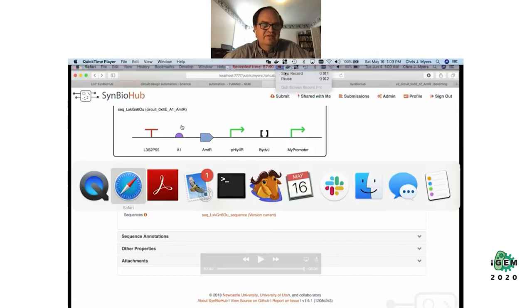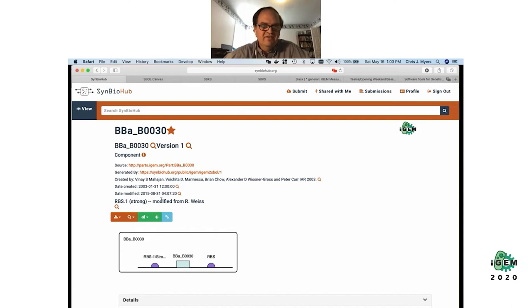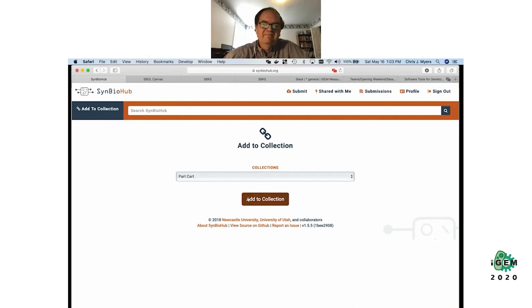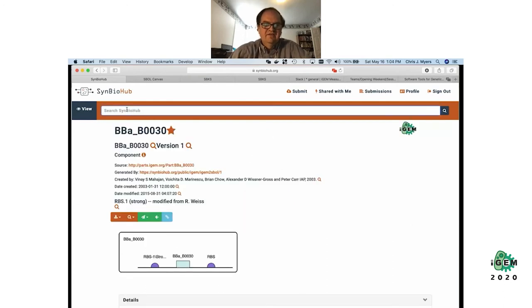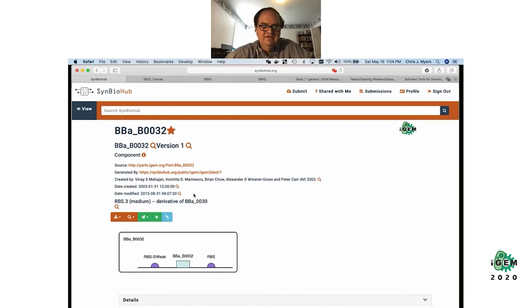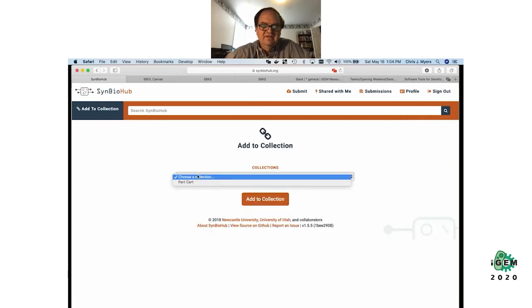Okay, this seems to be behaving again — going back to do the toggle switch design. I need to add more parts to my collection. I need another ribosome binding site, and then I'll add that to my part cart. I also need a couple terminators — let's not forget those.